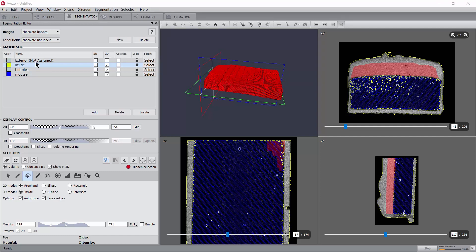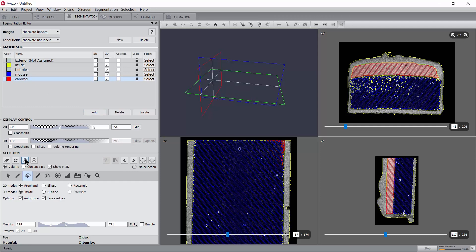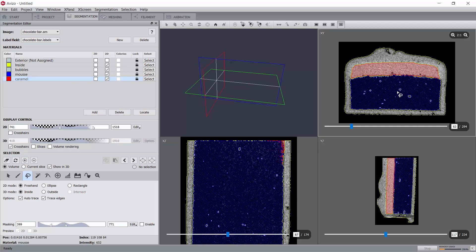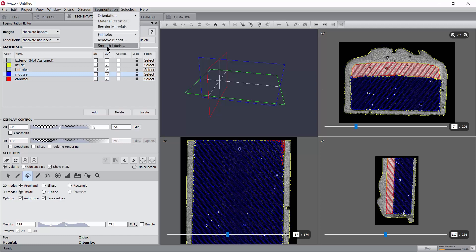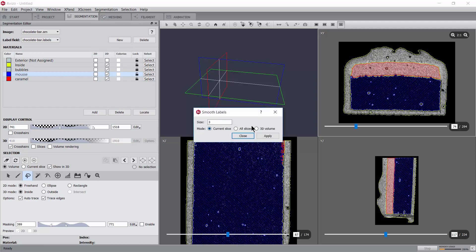Now, let's lock the bubbles and the mousse materials, and assign that selection to a new material, caramel. To finish with the segmentation, let's lock only the bubble material, and use Smooth 3D to smooth out the label field, while preserving the bubbles.